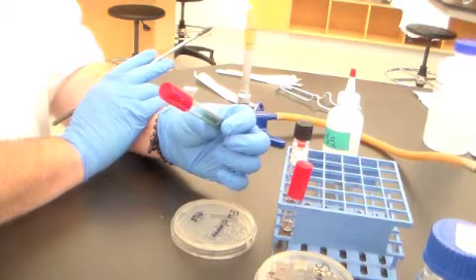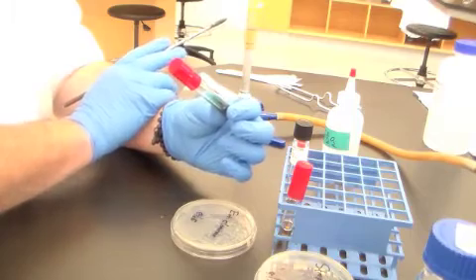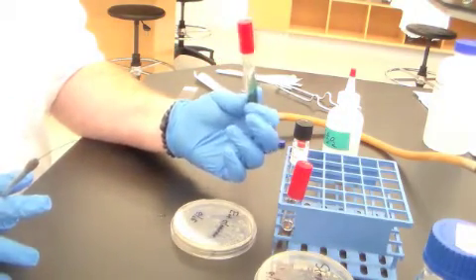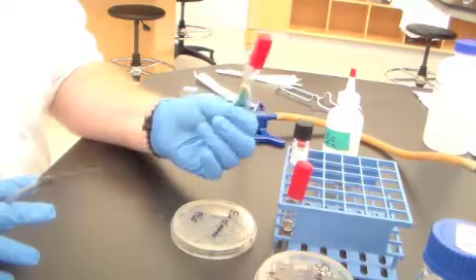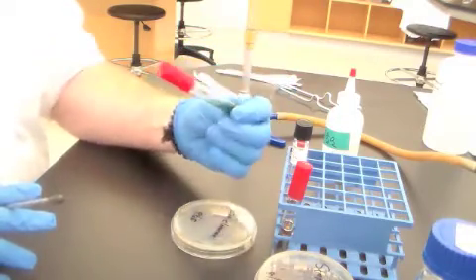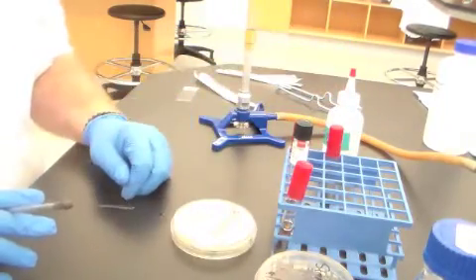Bacteria, even if they can use citrate, don't grow especially well on citrate, so you don't see much evidence of bacterial growth on here, but if they are growing on here, they will produce a pretty significant pH change, which causes this to turn blue. I didn't bother to label this one because there is nothing else that we can confuse a Simmons citrate agar slant with. So those will all be inoculated.